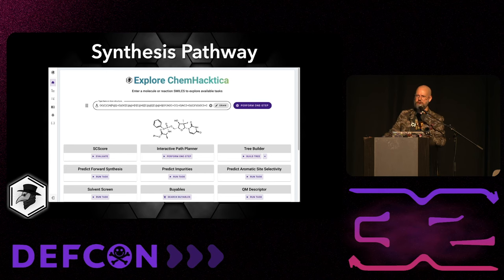And for those of you who are super chemistry geeks, you'll see that there are 8 other modules within this as well. Typically what happens, which I'm going to show you in a moment here, is that you will just ask it to say, what is the simplest way I can get from point A to point B? But there are so many parameters that you can tweak. You can say, do not do anything that has a controlled substance as a precursor, because those are hard to find. You can say, don't use any precursors that are too expensive. If you want to have safety parameters and say, don't use anything as a catalyst that's a heavy metal, you can do that as well.